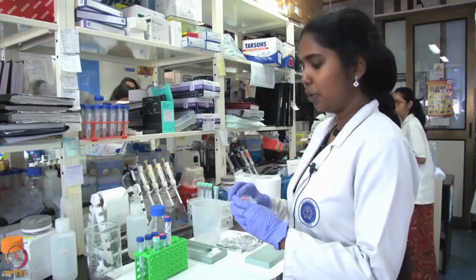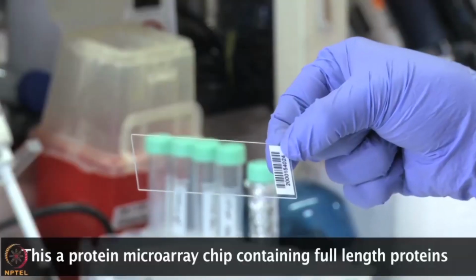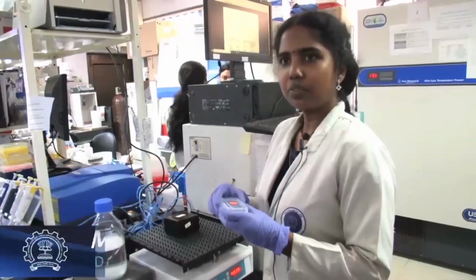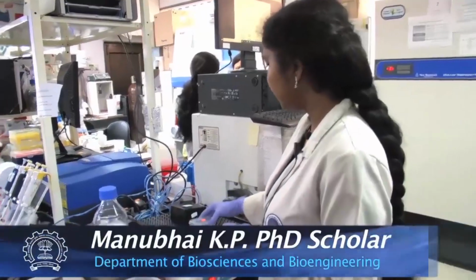So, I will be showing how to do autoantibody screening using HuProt arrays. After adding blocking solution, you have to keep it for 2-hour incubation at room temperature with gentle shaking. So, we are keeping it in the rocker.